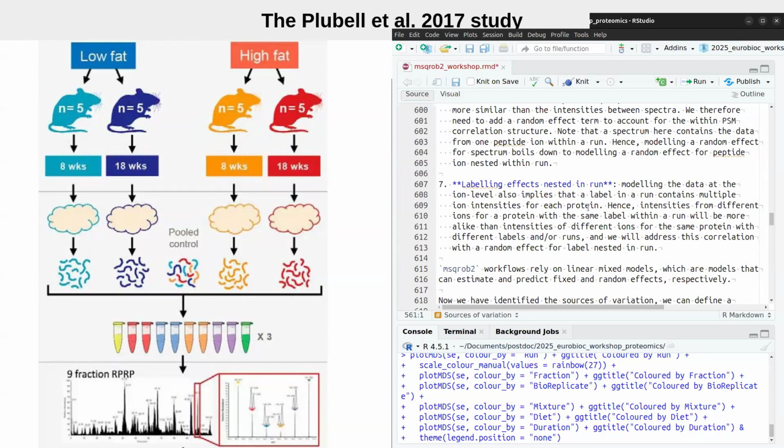This is becoming complex, so maybe let me try to explain this again. So we have different runs. The way to see it is that you have a protein pool and a sample, and you start testing the peptides, and you use all these peptides.